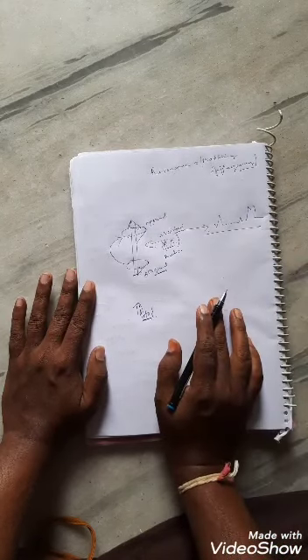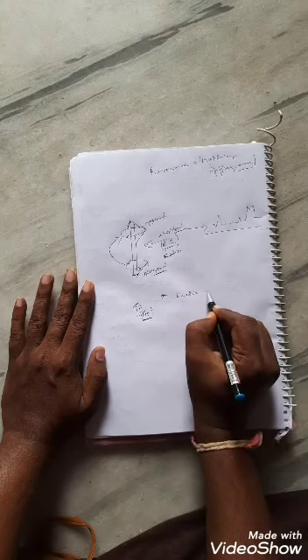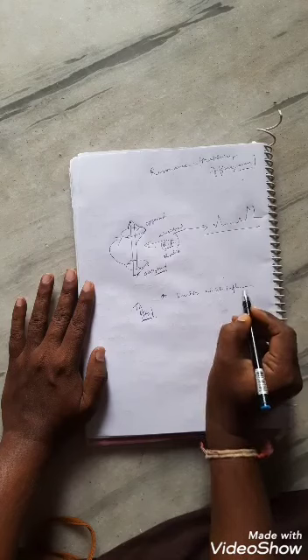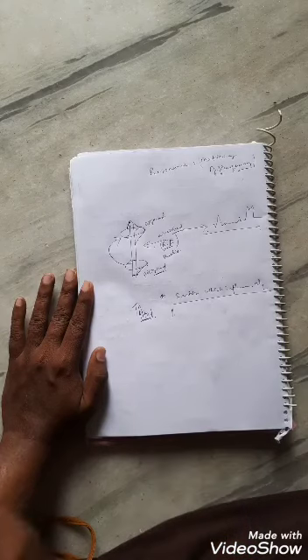So there are a few factors which influence the precessional frequency or Larmor frequency.